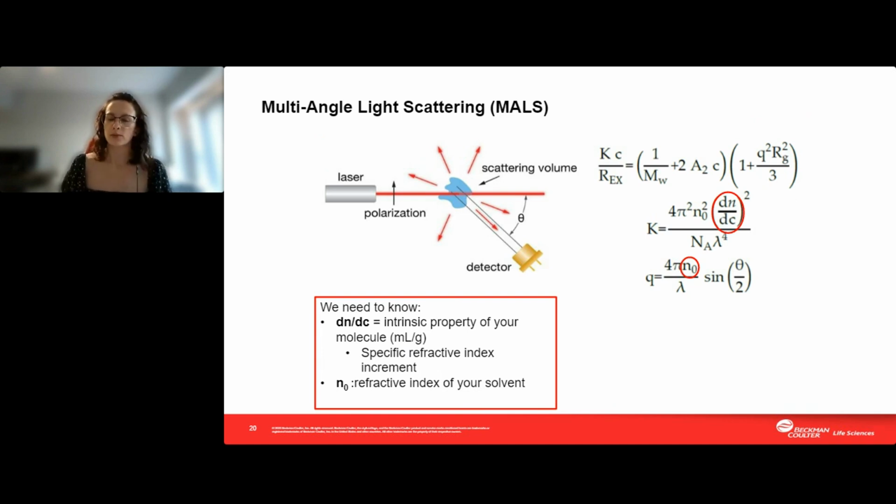So the first method that was used to characterize this cyclization was SEC-MALS. The way that this method works is that we originally separate our sample over a size exclusion column, separating any molecules that are present based on their size. The sample then passes through the MALS detector system. While it's passing through, it's shot with a laser. And when the laser hits the particles inside of the sample, it causes the laser light to be scattered. It's then detected at multi-angles, resulting in it being a multi-angle light scattering method. So we detect the scattered light at multiple angles.